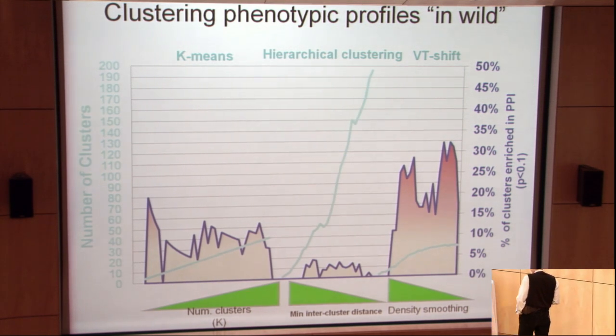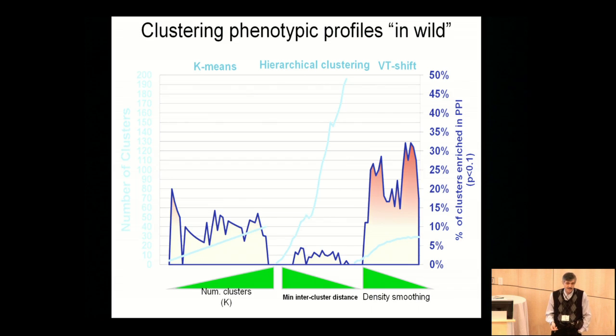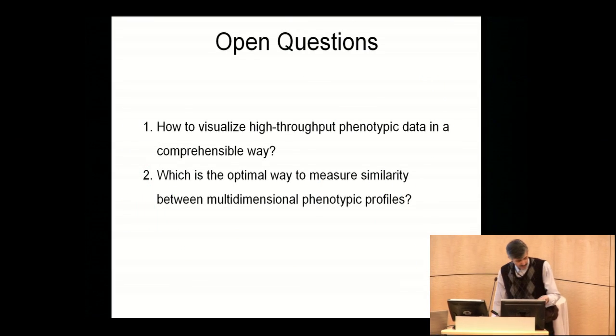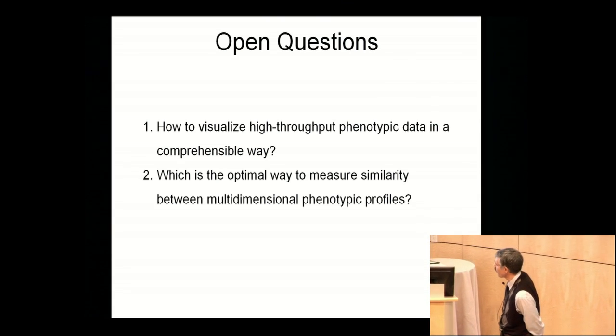So again, I want to put these two points together: visualization and presentation are essential, but what matters is what they present. If the clustering algorithm is not working well, does it matter how you present it? It may even be misleading, because what you present here is mostly noise. So in this case, I'm almost out of time. I want to finish my talk and state the questions which I still see as open.